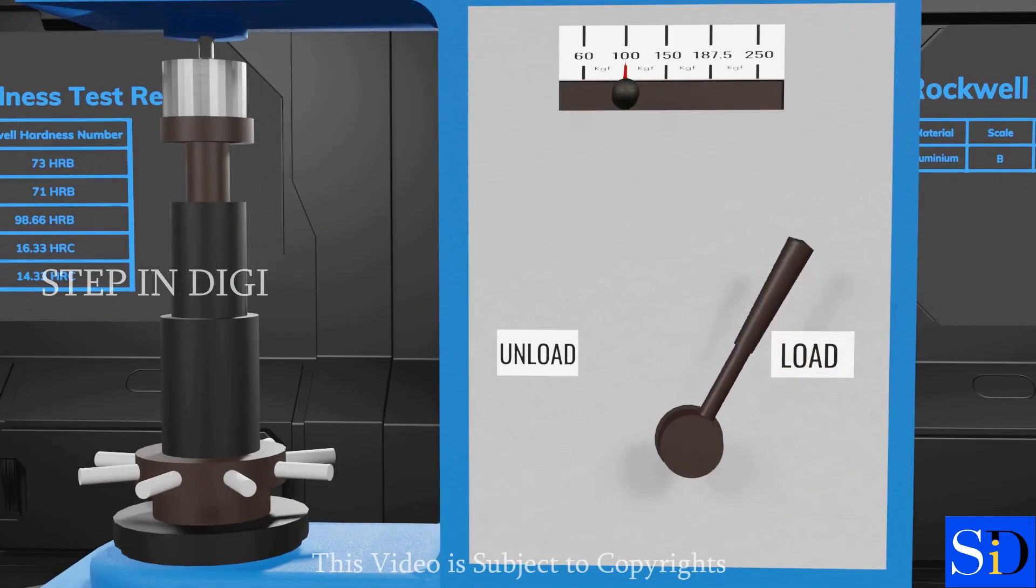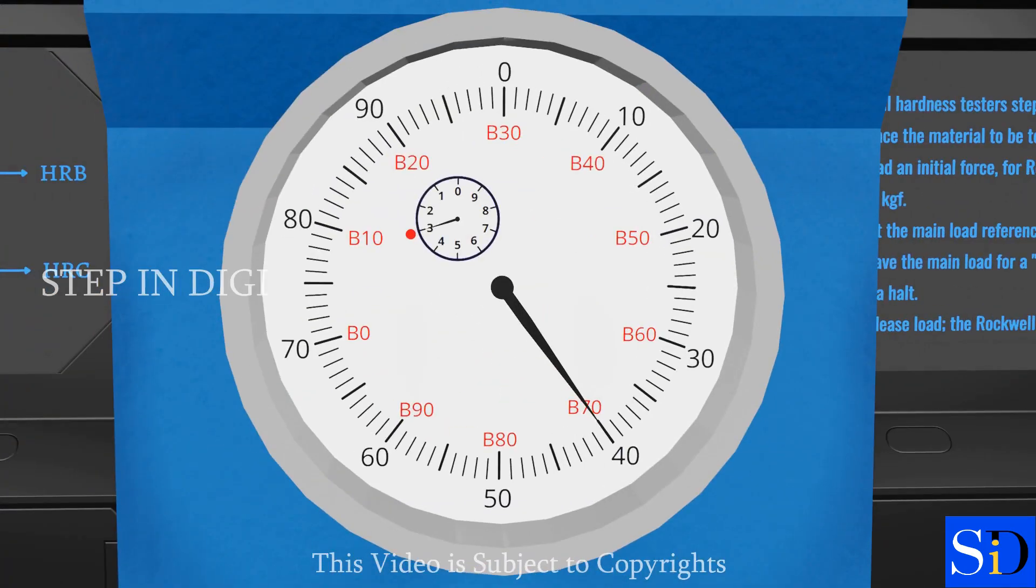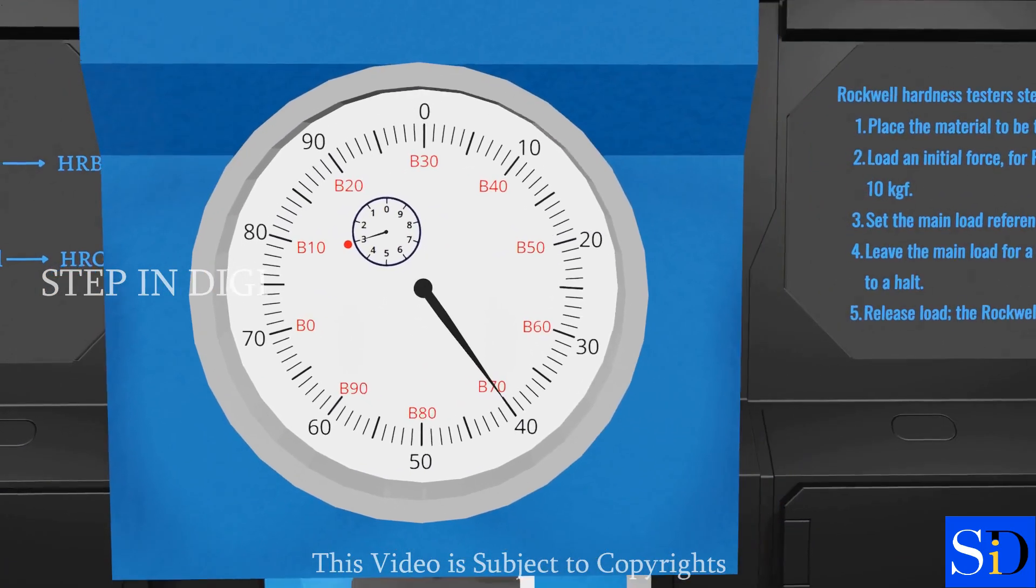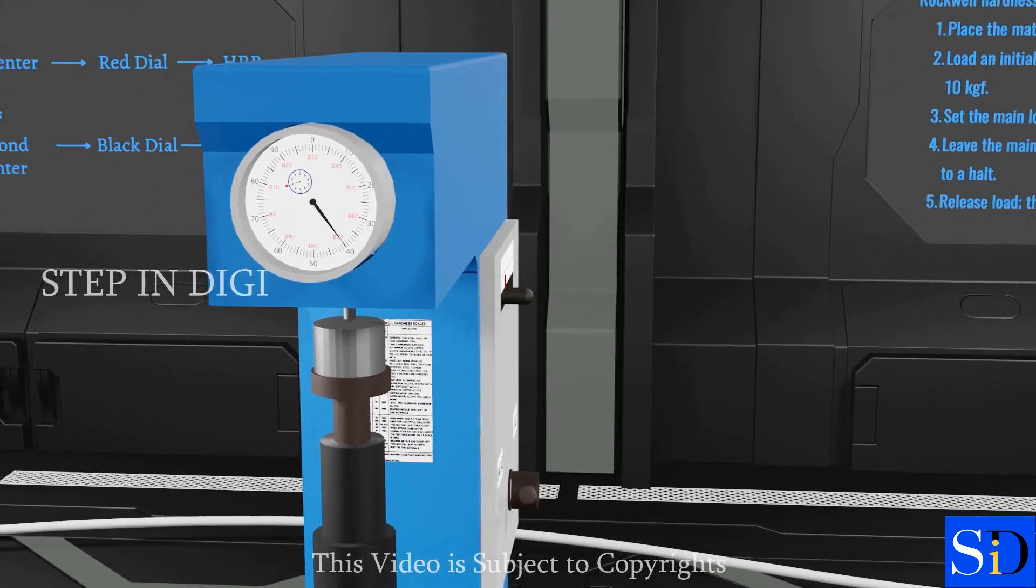Now, pull the lever back to unload position. Look at the dial and note down the reading. Repeat the same process three times for each material, and take down the values.